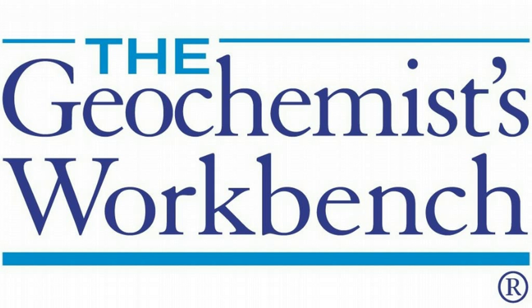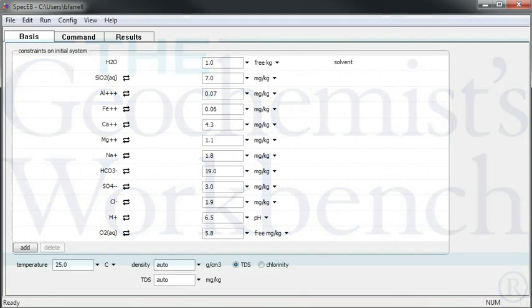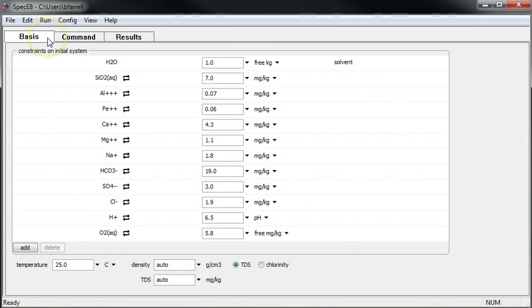Hi, this is Brian Farrell with Aqueous Solutions, LLC, makers of the Geochemist Workbench. Today I'll show you how to use Speciate to calculate mineral saturation indices and gas fugacities.